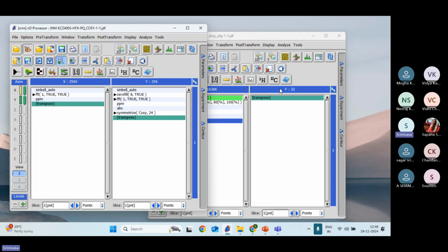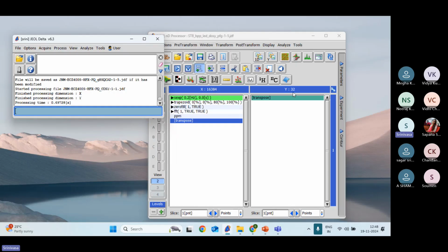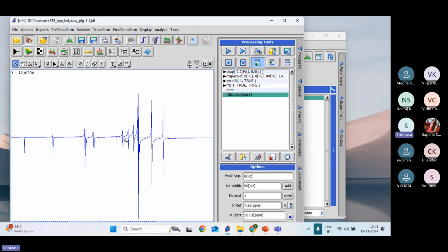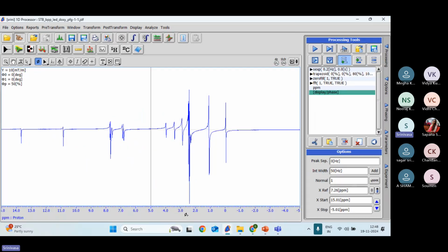So this makes a difference. Now, DOSY is a lesser time, 2D NMR is a larger time. Okay. So 32 is more than enough for the DOSY experiment. Now, processing of DOSY experiment, click here, click 1D, then make the phase correction of the spectrum. Take a phasing, adjust the phase correction first.